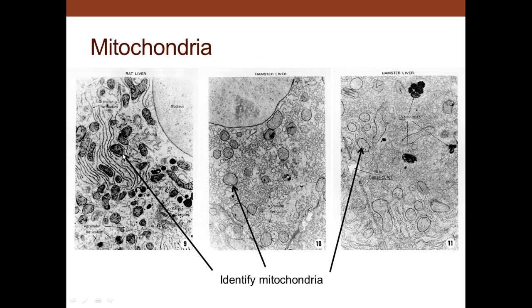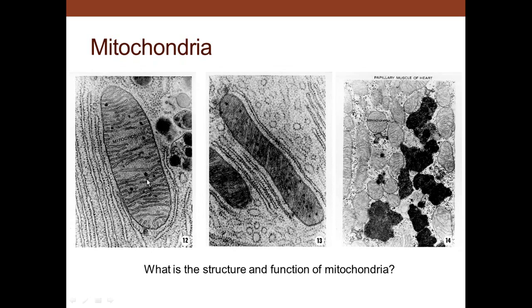So here we see mitochondria here, here, and here. This is smooth endoplasmic reticulum here, rough endoplasmic reticulum there, and some smooth endoplasmic reticulum located in through there. These are lysosomes. There's actually secondary lysosomes that we have here. Mitochondria could have tubular cristae, and they have more than one membrane, so double membrane. There's mitochondria here and mitochondria that we see there. This is lipofuscin or mitochondria.